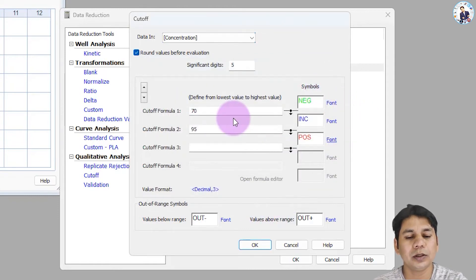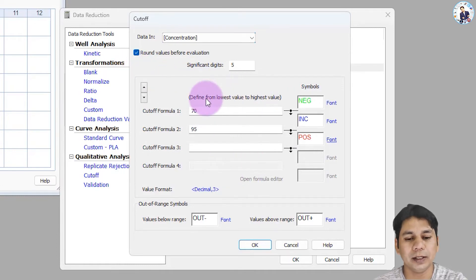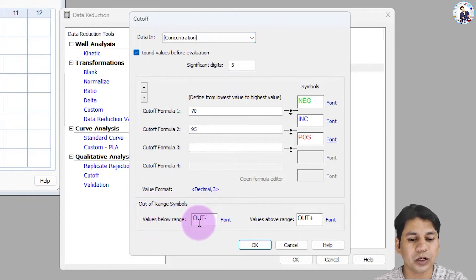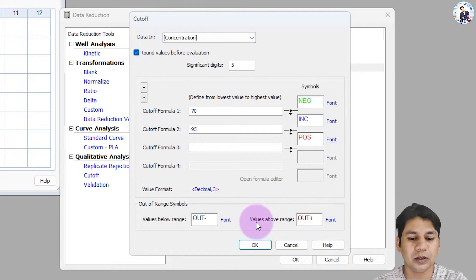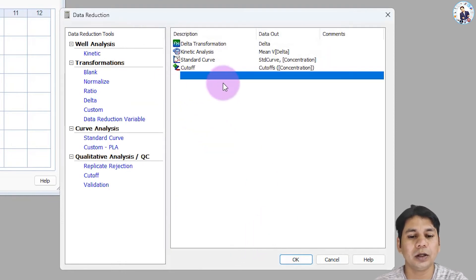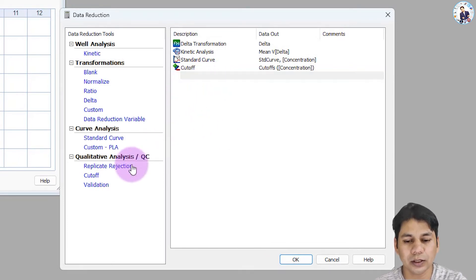In this way you can define your cutoff for your clinical assay. You can also see the out-of-range settings: out-minus for values below range and out-plus for values above range. Click OK. The last thing to set up is validation — click on validation.